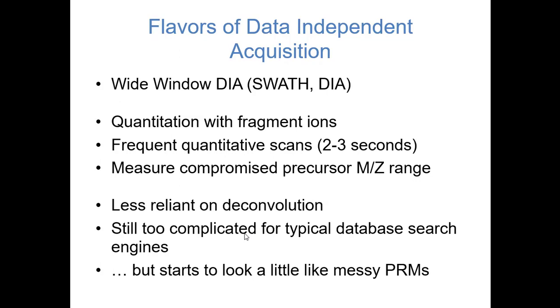That said, it's still much too complicated just to give to Sequest or to Mascot to interpret. But it does start to look like PRMs.